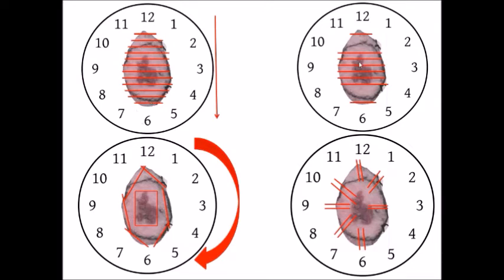This is something very similar, except we're not going to submit this area or this area. We're just going to submit the skin ellipse tips here and here, probably in one cassette. We could differentially ink one end of it in that cassette. And then we're going to submit the remainder of the lesion, kind of block it out and submit the remainder of the lesion and the adjacent skin and soft tissue here.